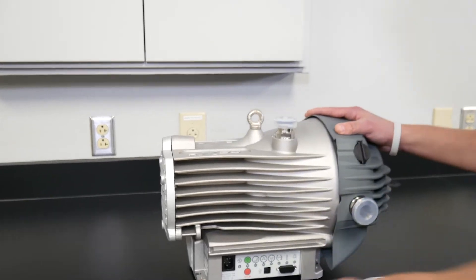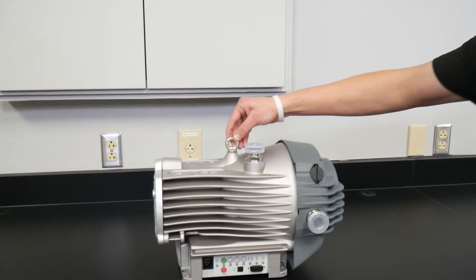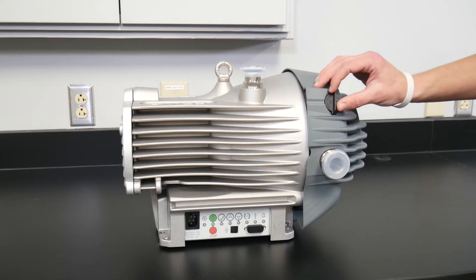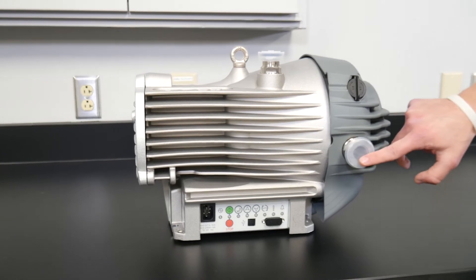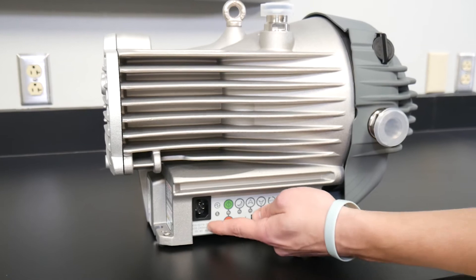Take a moment to familiarize yourself with the vacuum pump. Locate the lifting eye, inlet port, gas ballast control, exhaust port, user interface panel, and power connector.